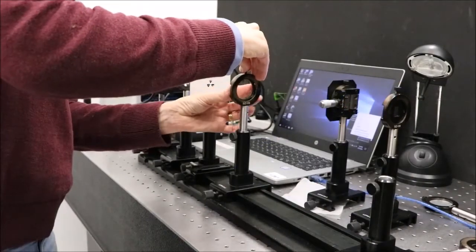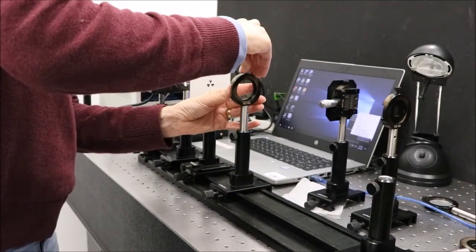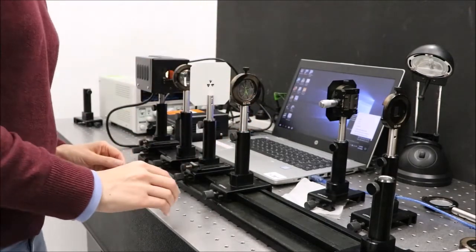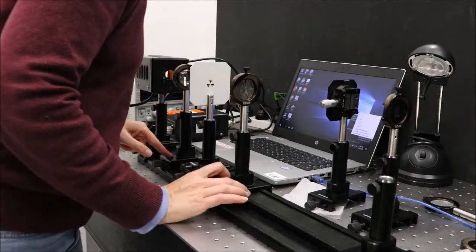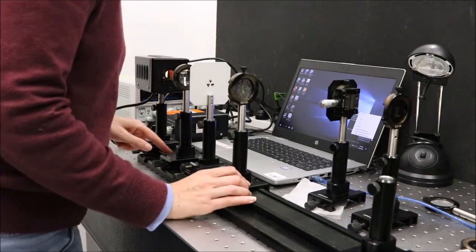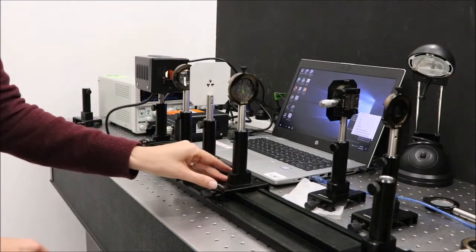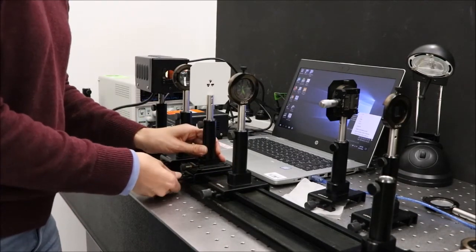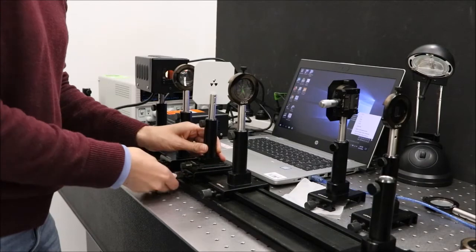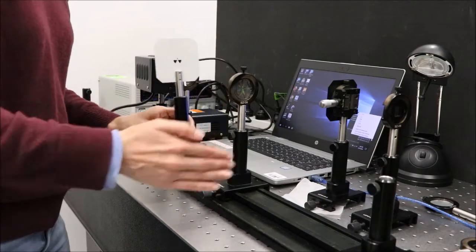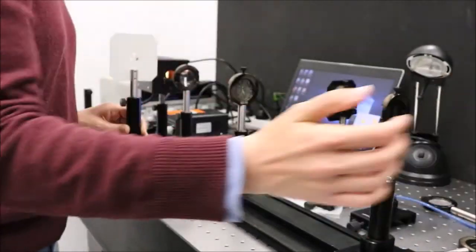Add the collimator lens to the rail and move it so it's about 20cm from the collector lens. We'll take out the screen and adjust the position of this collimator lens so that it gives us a roughly parallel beam of light traveling down the rail.